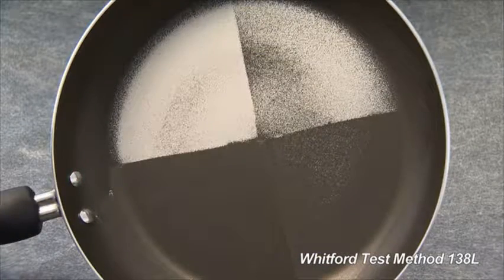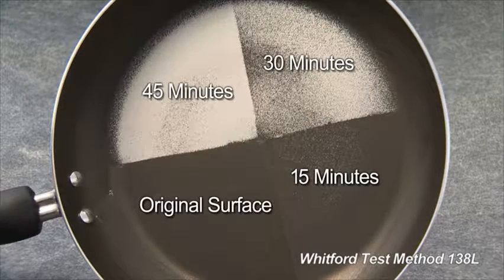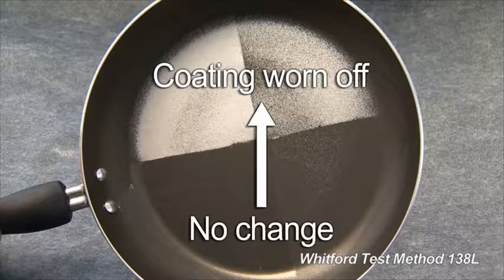We now have abrasion tested for 45, 30, and 15 minutes, and can compare them with the original surface. Each of the three tested quarters is rated on a nine-point scale, from no change to coating completely worn off.